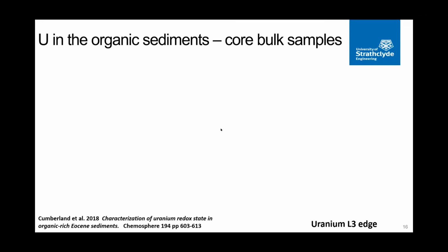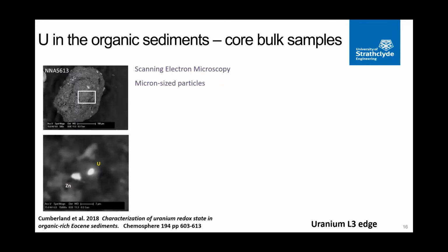So coming on to the samples and the analysis side of it, I was given a bunch of samples and asked to characterize them. The first sort of hurdle on that was I had the Geiger counter out, and I found the most radioactive one, but as I was sifting through it, it became less radioactive.